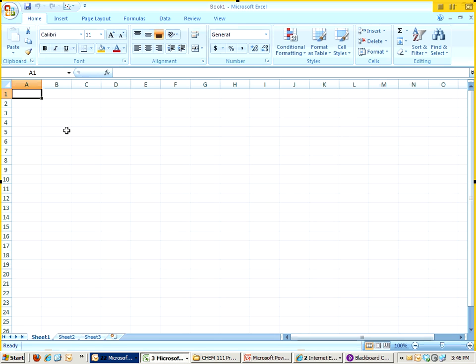Hello, some of you asked for me to record how to set up a spreadsheet for lab number 2 with the metric system and analysis of error with respect to weighing out 50 milliliters of water from a variety of pieces of glassware.